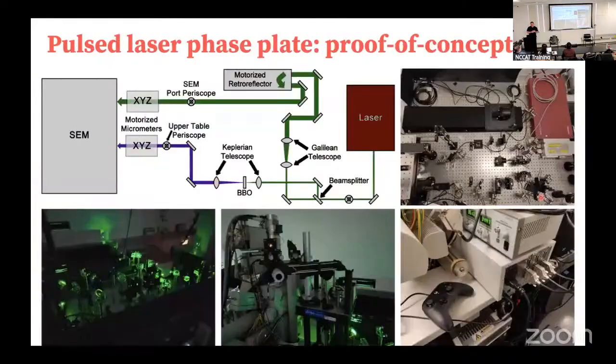And so this was the setup that we used and developed. The way that you do this timing that I've mentioned, the synchronization between pulses, is you start out with a laser. You're emitting green laser light, you pass that through some mirrors, and at some point, you split it into two parts.